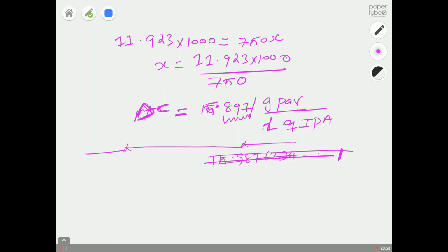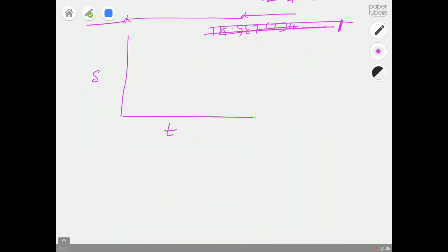And then, as I said before, in your final report you have to make a plot of supersaturation versus time. Yeah? Since you started your experiment at 1.18, the first value will be 1.18 when time t equals 0.